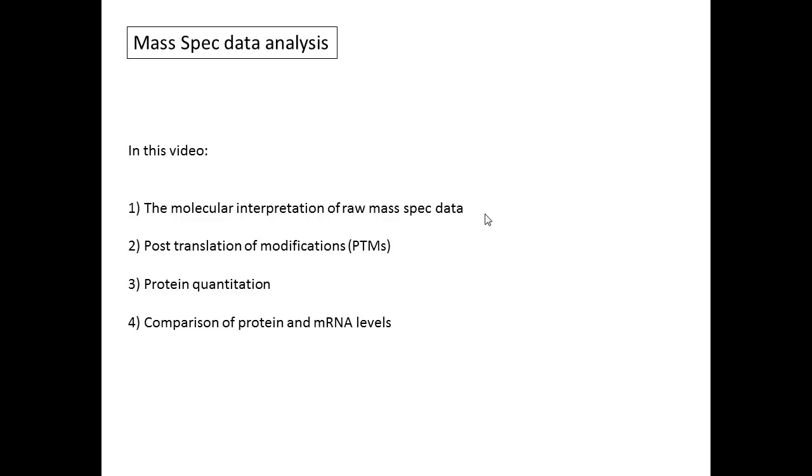Hi there. In this last video about proteomics, we'll talk about how we interpret the raw mass spec data. We'll say a few words about one of the advantages of proteomics, and that's our ability to measure post-translational modifications. We'll talk about protein quantification, and we'll end with a few words about the comparison of protein and mRNA levels.